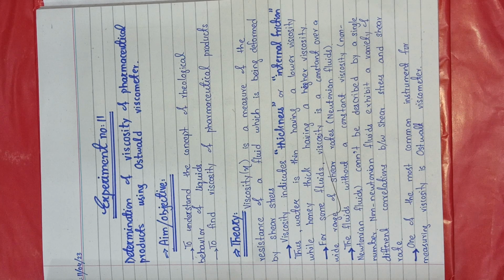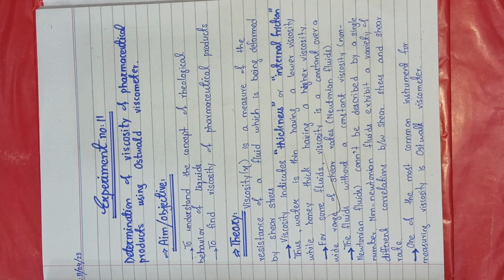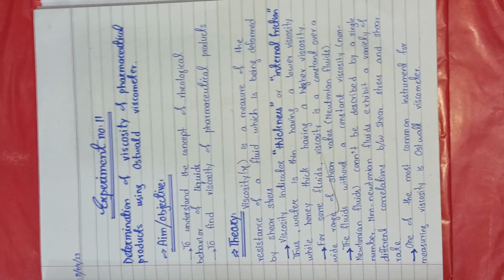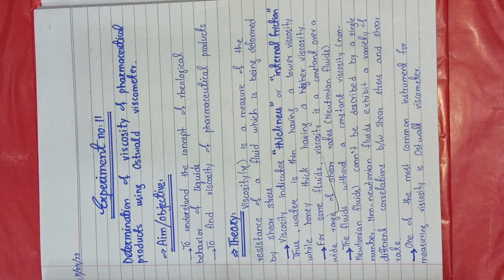The second main objective of this practical is to find the viscosity of different pharmaceutical products. That is very important because we prepare a lot of pharmaceutical products, and in the production of these products, we have to calculate their viscosity because we have a limited range of viscosity to produce. We cannot prepare overly viscous products such as creams and lotions, etc. Therefore viscosity determination is very important for all of us.